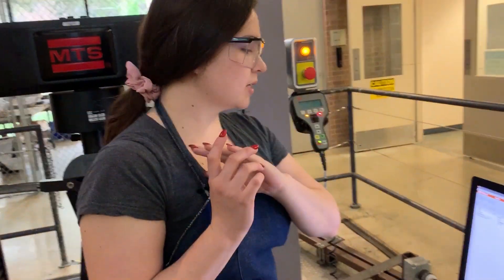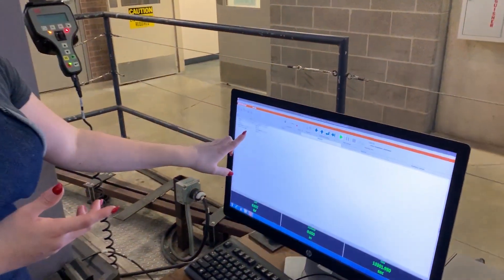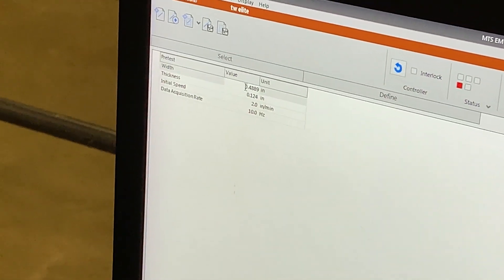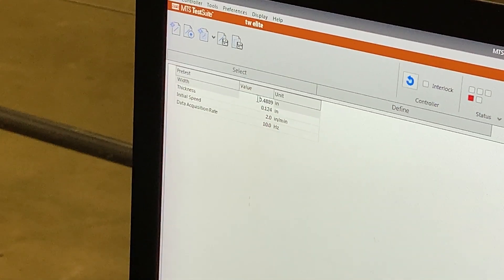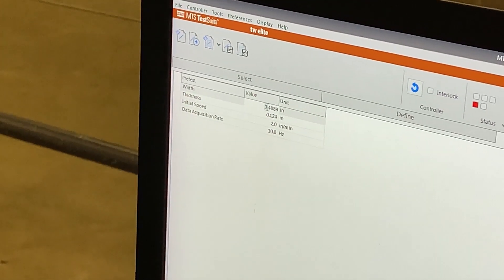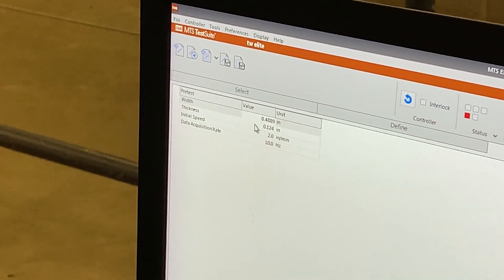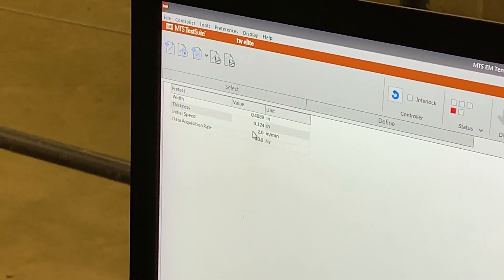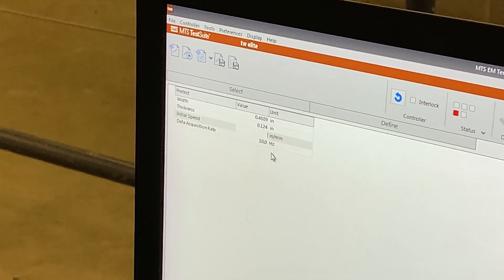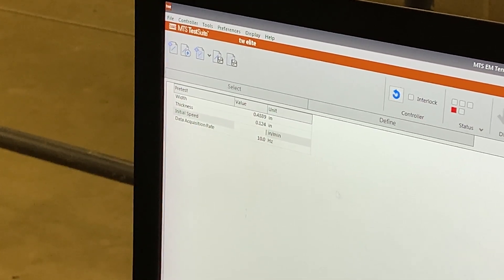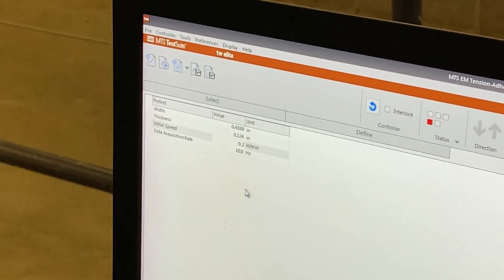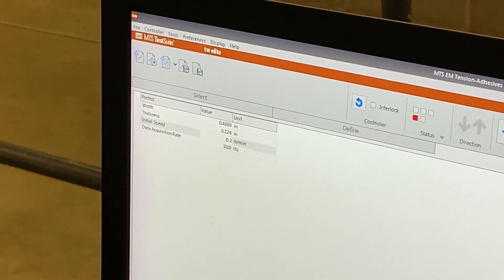The only difference now is putting in these parameters: our width is going to be the biggest number from your dimension, 0.4889, and our thickness is going to be 0.124. We're going to set our initial speed to 0.2 inches per minute at 10 hertz, and leave everything else as is.